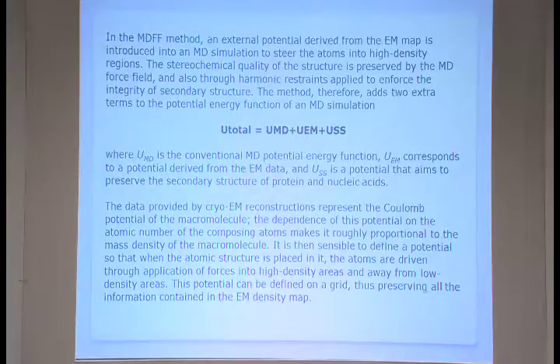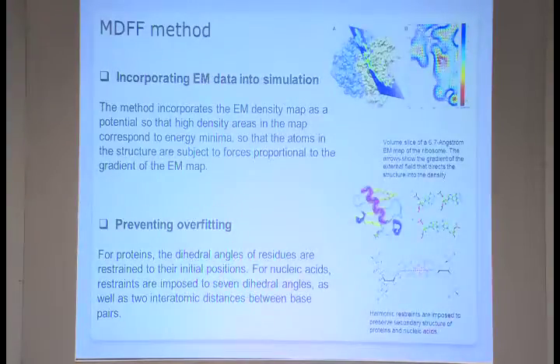As you already heard, all the mathematical equations, I thank Professor Garib, he already explained in the morning. So here also it's just the secondary structures and cis bonds, these dihedrals, and also there are other structures, like the dihedrals of the RNA bases or DNA, and then all the protein structures, they are all restrained.